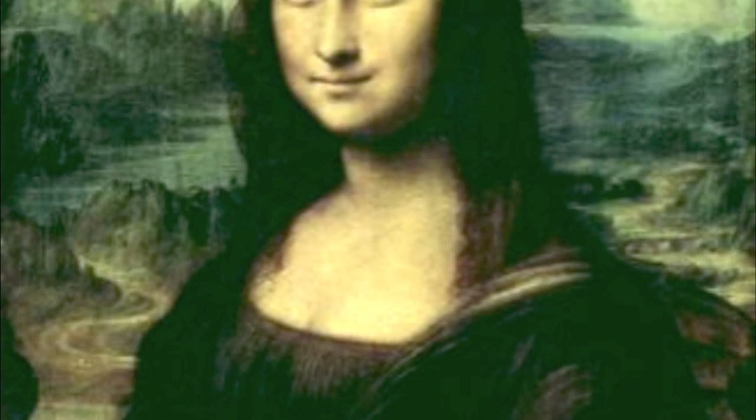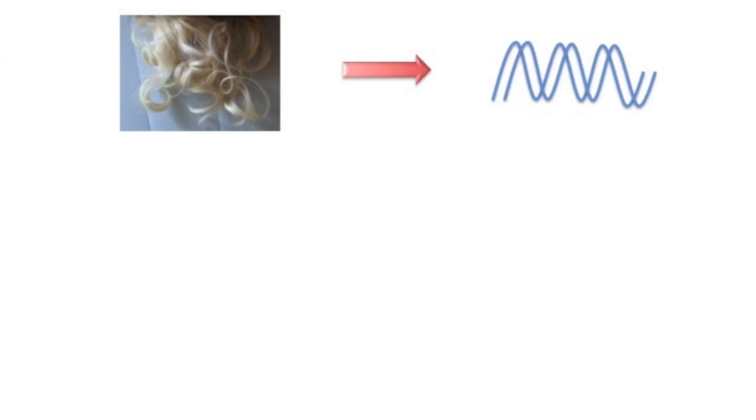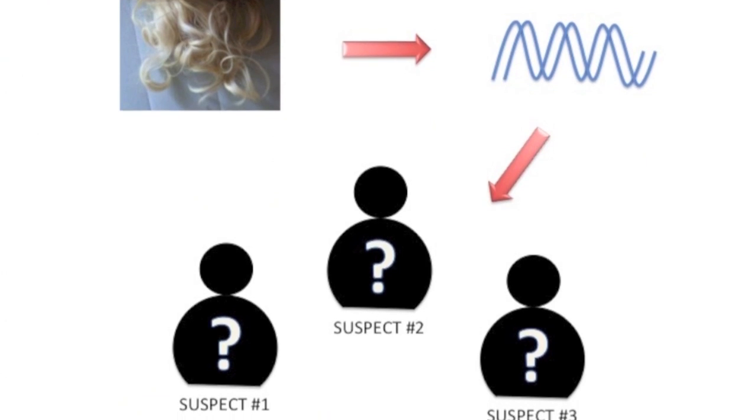Have you ever wondered how the police identify the culprit of a theft when he doesn't leave behind any fingerprints, but often leaves behind something as simple as a strand of hair? For example, imagine that the Mona Lisa has been stolen and the police have arrested several suspects. They have also found a strand of hair left behind at the crime scene. How can the police use the DNA in the follicle of the hair to identify the thief?